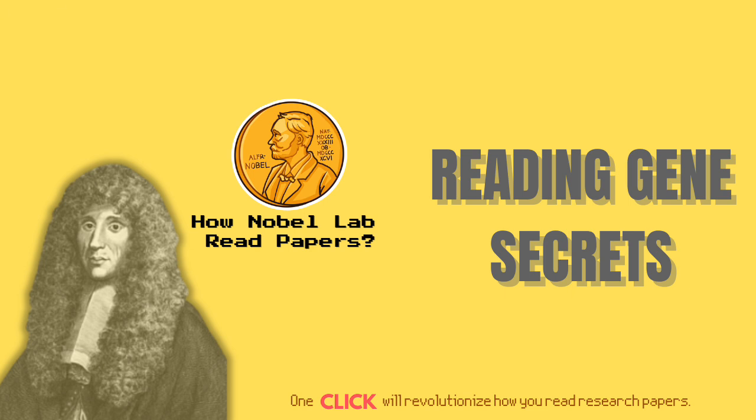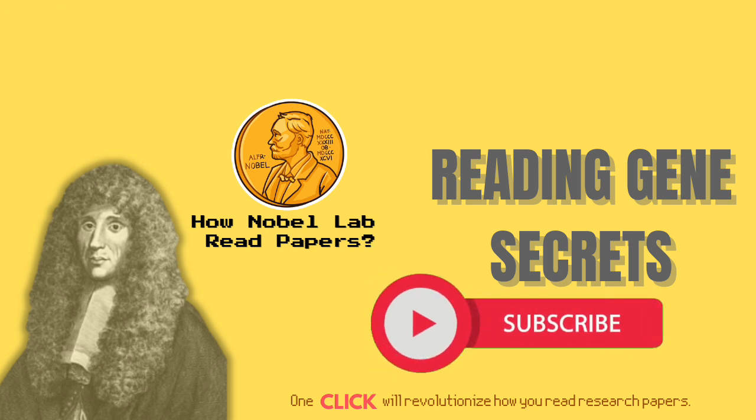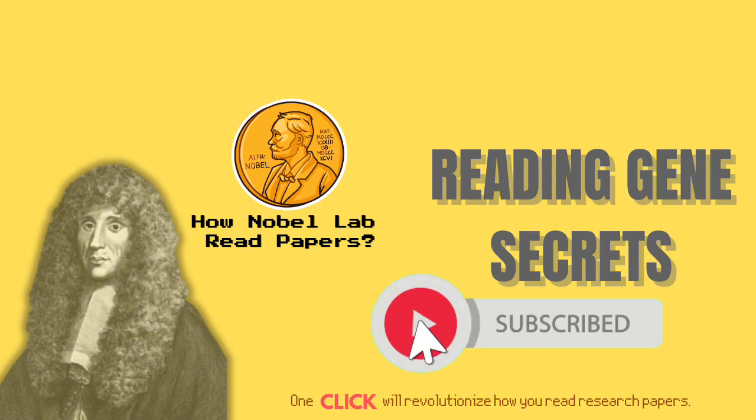Reads were short, though, only 25 base pairs. Wow. Millions of tiny sequence snippets. And the last step is figuring out where they all came from. Precisely. That's the computational part. You take all those millions of short reads and map them back to the reference genome, find their original location.